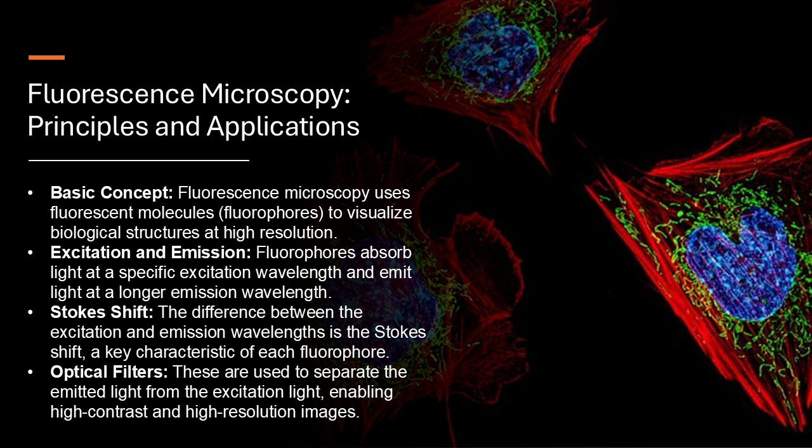It makes me think about the fluorophore lifetime. Are there limitations on how long we can observe these cellular processes? That's a great question, and it highlights a challenge that researchers often face. It's like a ticking clock. You have to capture your images quickly before that signal fades away. So it's a race against time to capture these molecular events. Exactly. But scientists are always pushing those boundaries.